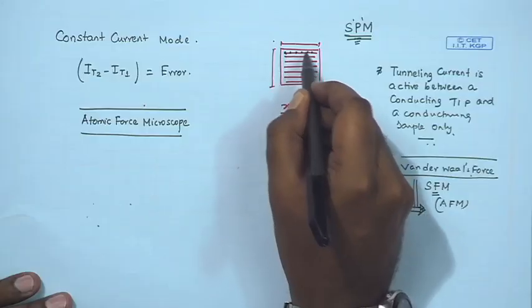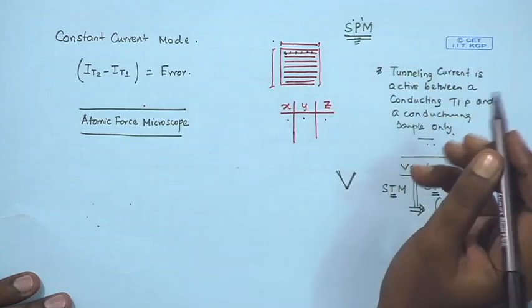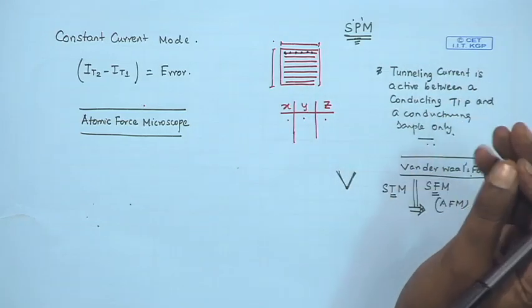It is interesting that an AFM also uses a tip, but firstly this tip is much wider than an STM tip. Second interesting thing is, an AFM does not need a tip in order to generate tunneling current, but you still would like to use a tip, because you are going from one point to the other to gather the information, and if you have some probe that is very blunt, you are going to lose on your lateral resolution. Therefore, an AFM also uses a tip.